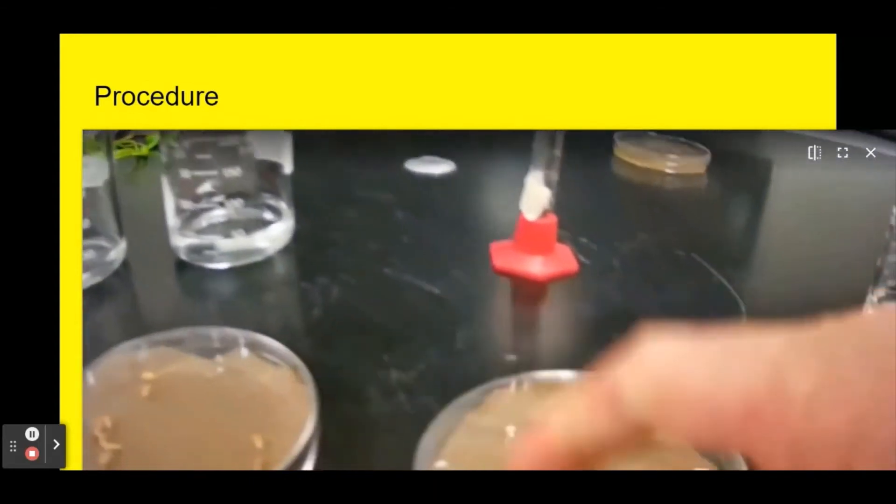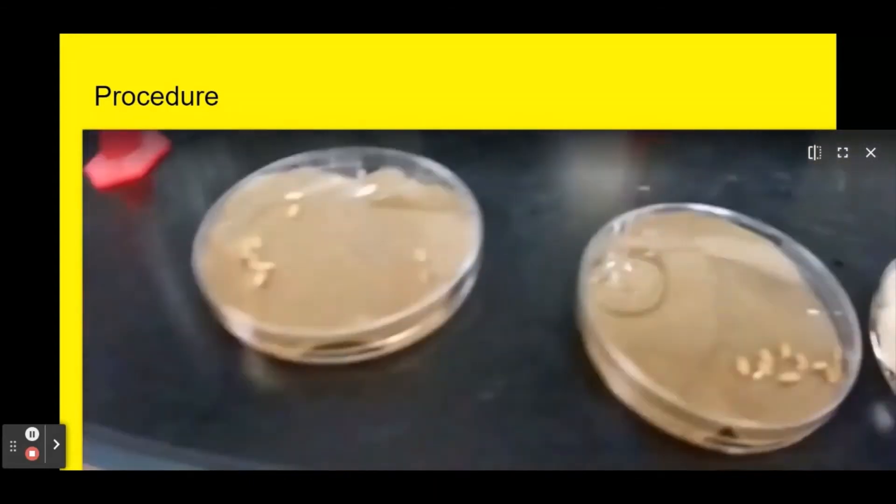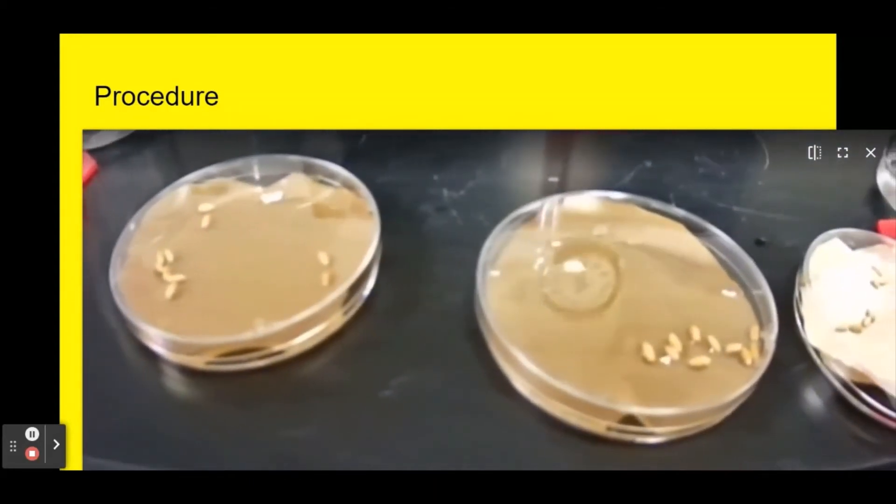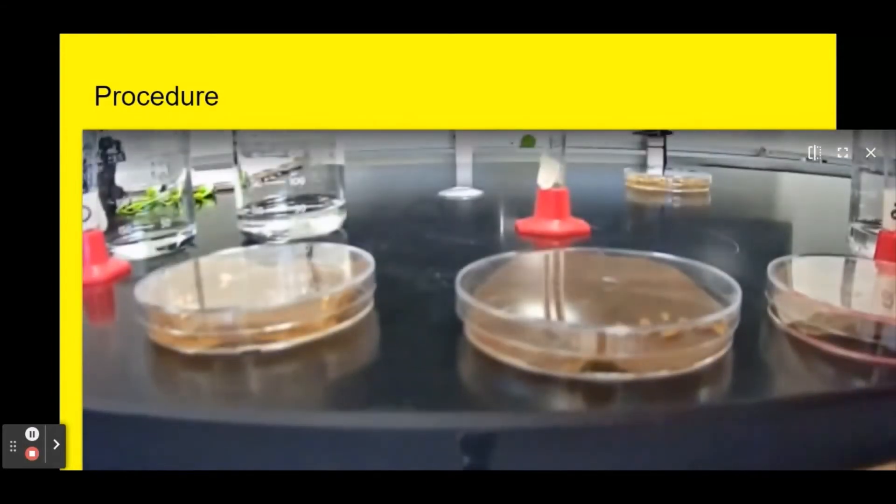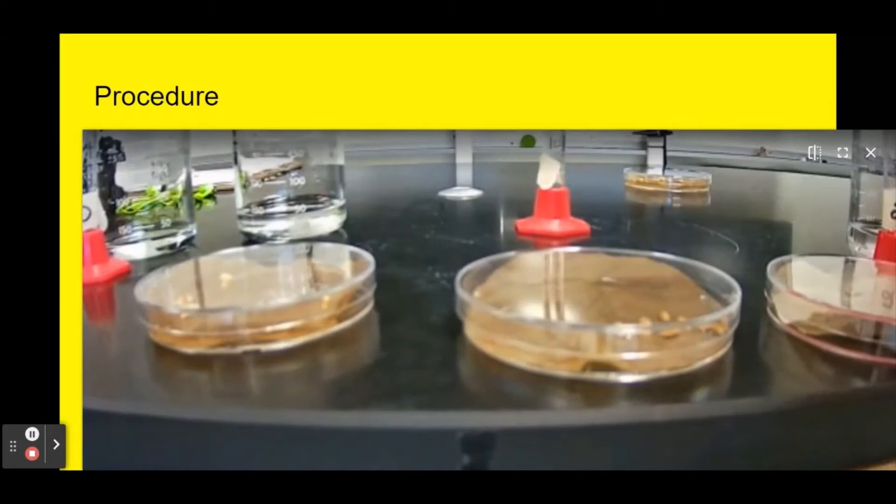The last step is I'm going to label each tray so I can keep track of which tray is which, and then I'm going to put them in a dark location for three days. In my case I actually put them in one of the drawers in my classroom. After three days we're going to count how many of the seeds have germinated.